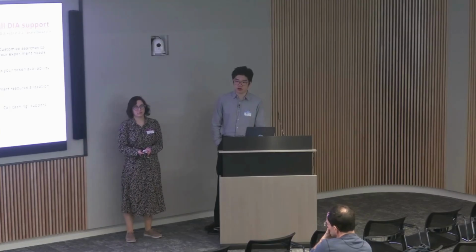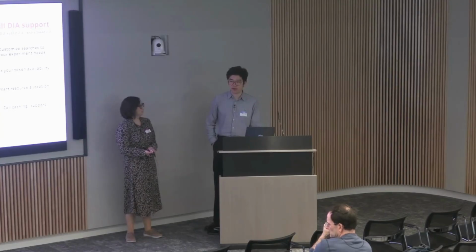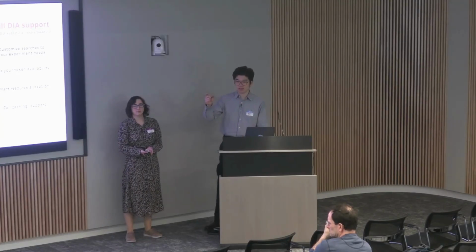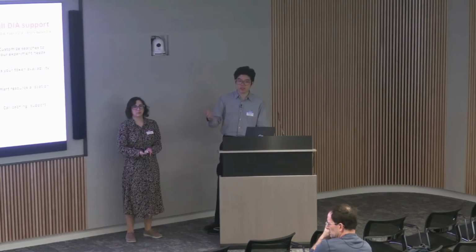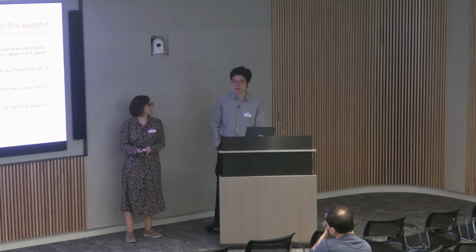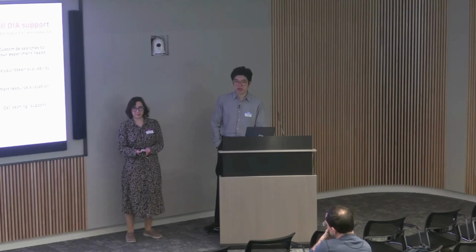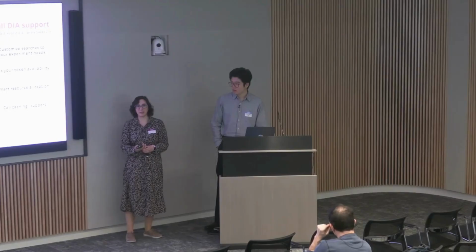So if you have 5 files in every VM, then for every one of those mini tasks you are spending about 5 hours. So I would imagine your runtime would increase by that fold. We did do some testing with more files in each VM. We'd be happy to show you what we came up with there.